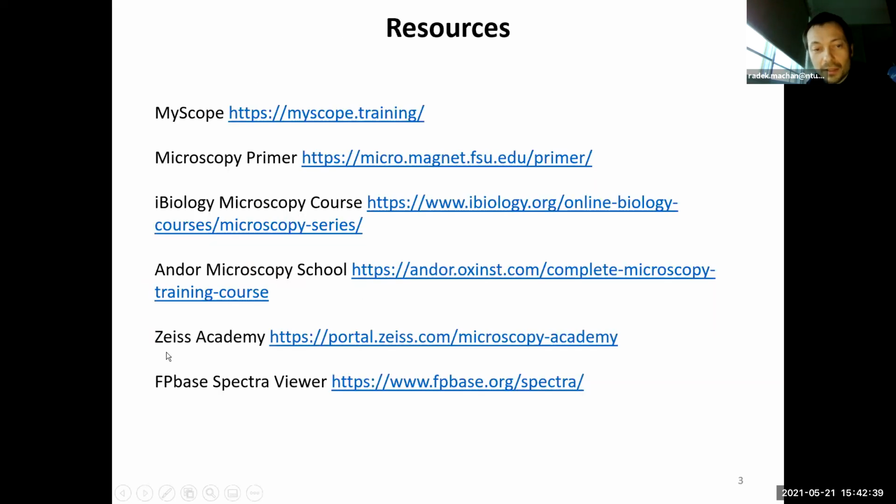Zeiss have now created a new website for all the microscopy related resources, which they call Zeiss Academy.